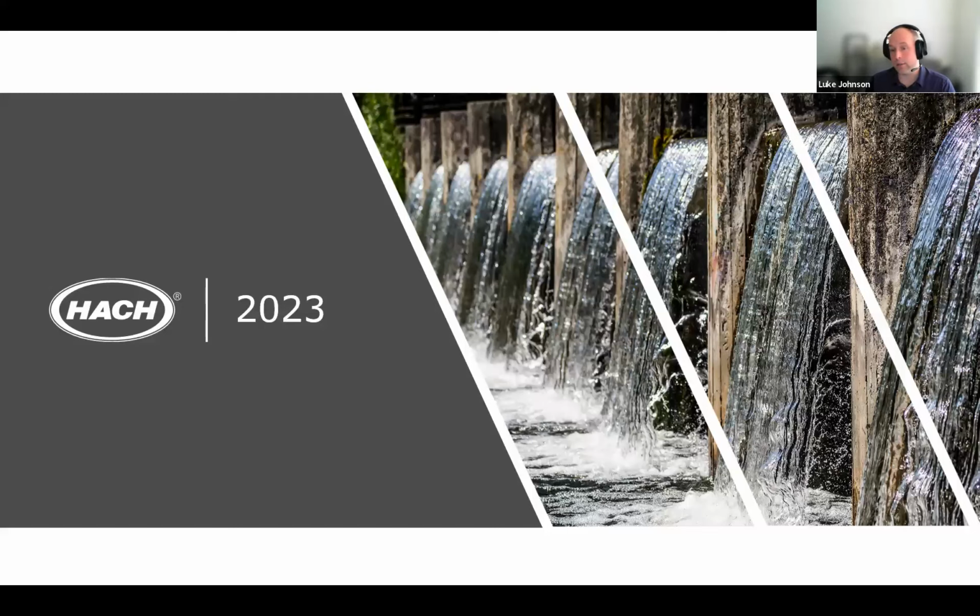There are benefits obviously to that. Lasers last a long time. There's less work in the optics as far as filtering. They're a very consistent light source, with less fluctuation. And yeah, Hach offers those in a variety of instruments. Some of the ones that I showed earlier, the TU5s in particular, are using lasers rather than tungsten bulbs.